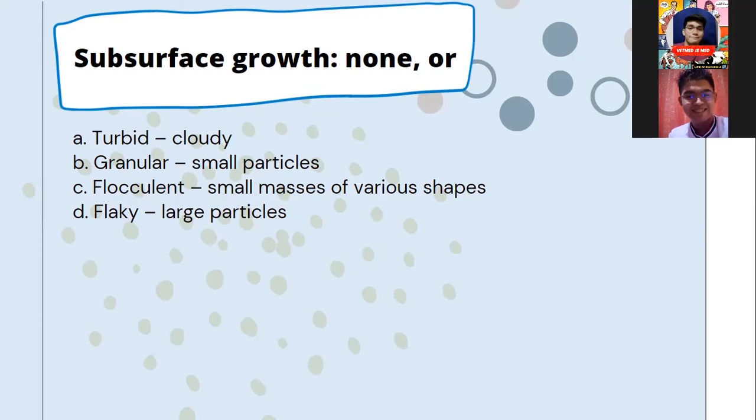2. Granular: small particles. For the cultivation and enrichment of non-fastidious bacteria, as well as the evaluation of disinfection performance, peptone and beef extract supply nitrogen, vitamins, amino acids, and carbon, while sodium chloride maintains osmotic balance.